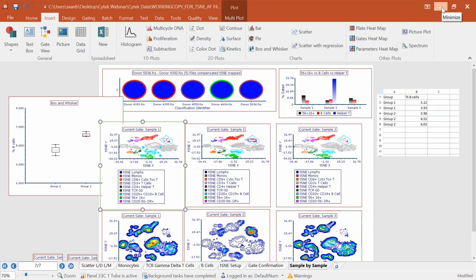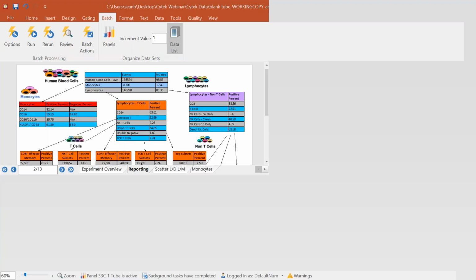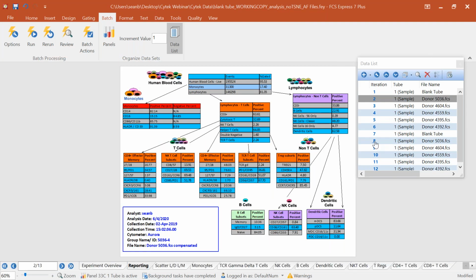Now, we maybe have lost sight of what this data actually is. We've all been looking at this like a standard flow cytometry experiment, but this is much more than that. This is a Cytek Aurora data set. It has full spectral capabilities. It has spectral signatures for every single cell that's in this data set. And FCS Express has a unique capability to actually access that raw spectral data.